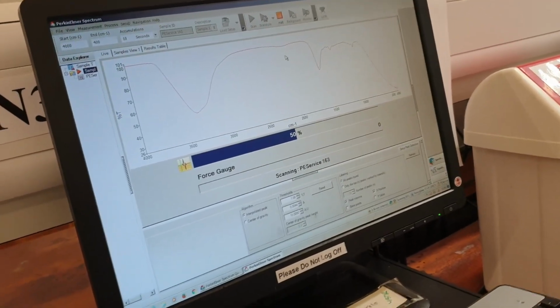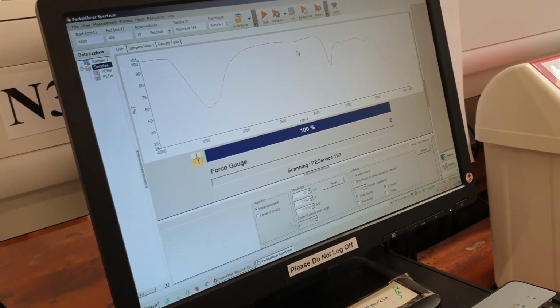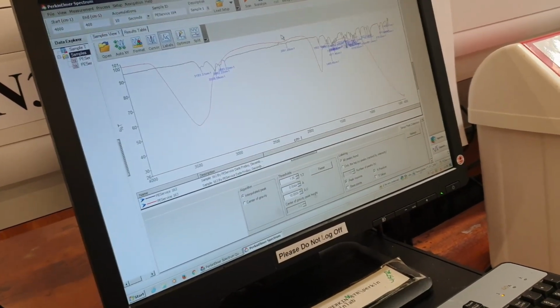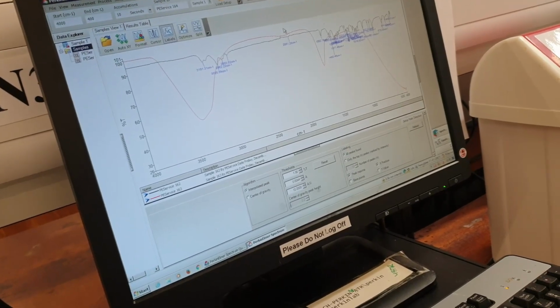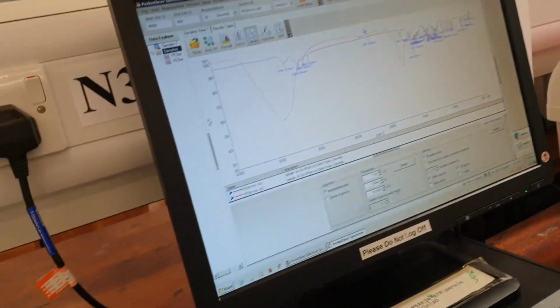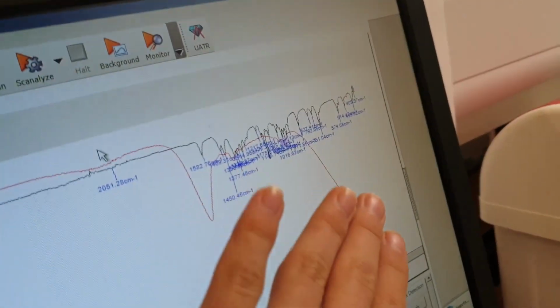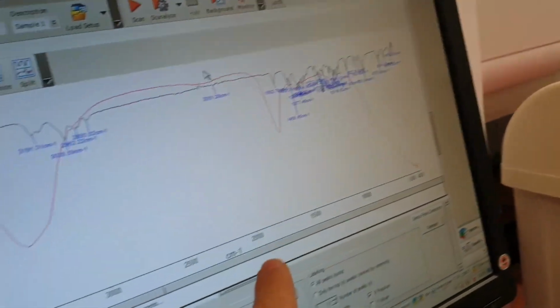Right, there we go. We got our IR spectrum for soy sauce. Because it's a mixture of stuff, we don't get super sharp peaks for specific bond stretches. It's just a mix of lots of bond stretches. So I'm not surprised that we just got a giant fat fingerprint region, which is just a huge sum of lots of stretches.